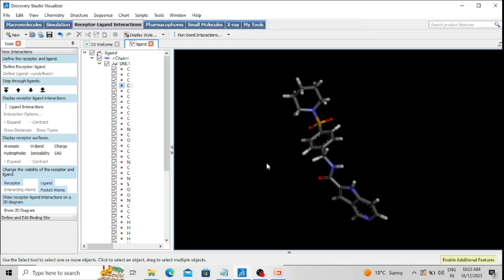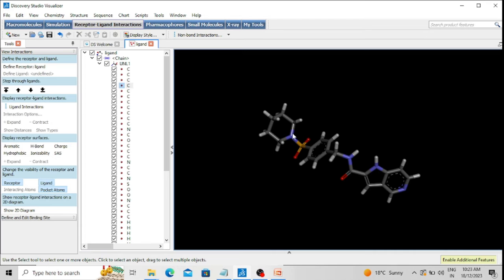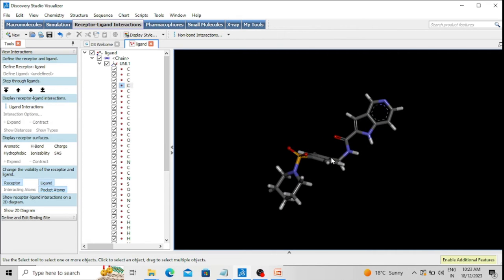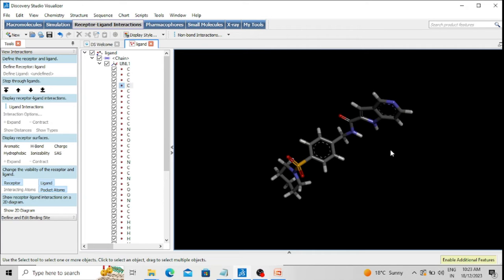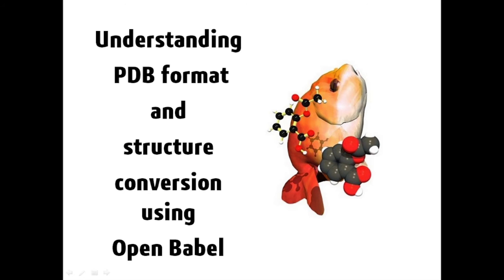Similarly, we can save structural information — the 3D coordinates of each atom — in different file formats: SDF, PDB, MOL, or MOL2. If a structural file format is 2D, then only x and y coordinates will be present. Along with coordinates, information about the connections between atoms is also present. Visualization software reads this information, positions the atoms in 3D space, and through the connections determines the structure of a chemical compound or protein molecule.